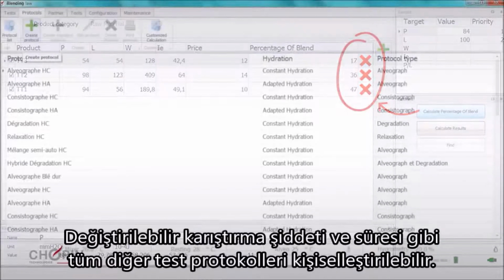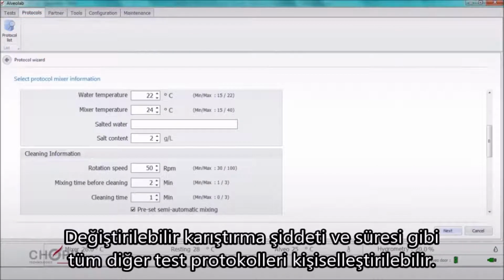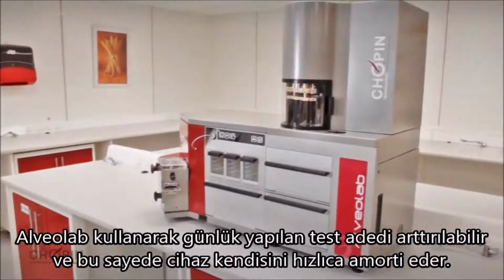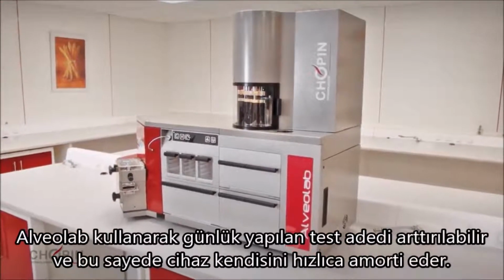Additionally, customized testing protocols can be developed by varying, for example, the intensity and duration of mixing. Using the AlveoLab, it's now possible to increase the number of tests carried out daily, thus optimizing the return on investment.